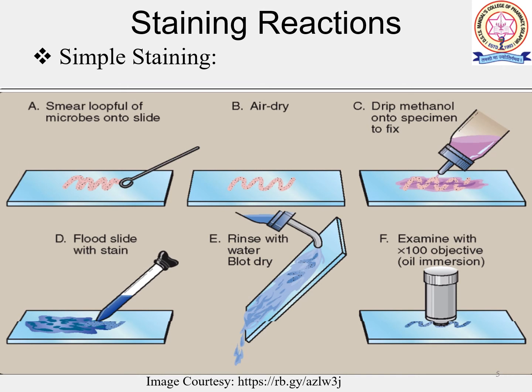Simple staining involves the staining of the bacterial cell and the cytoplasm, because both are negatively charged, and when the reagent is added onto the bacterial culture, it gives up the hydroxide ion or accepts the hydrogen ion. Due to this, the stain becomes positively charged.